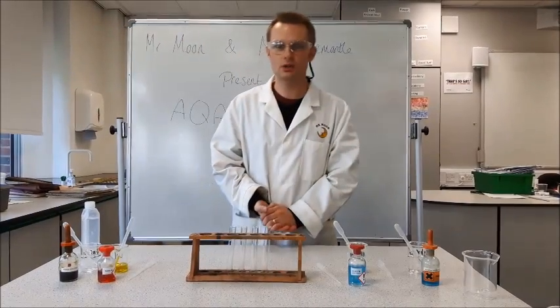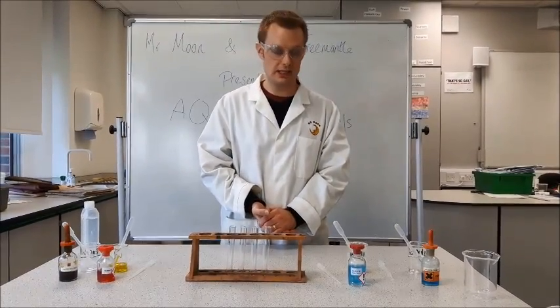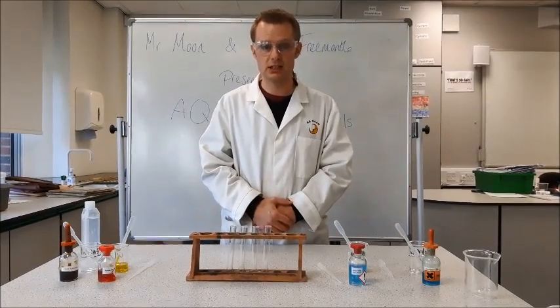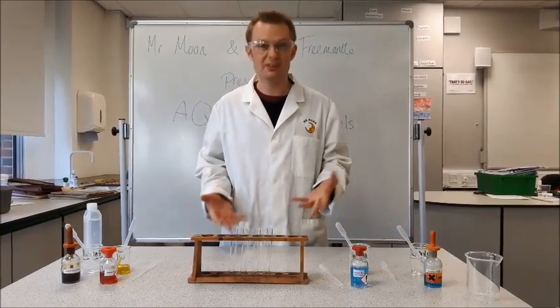Hello and welcome to this video on the biology required practical for food tests. I'm going to start by showing you the positive results for each test with some known solutions where it will definitely work.